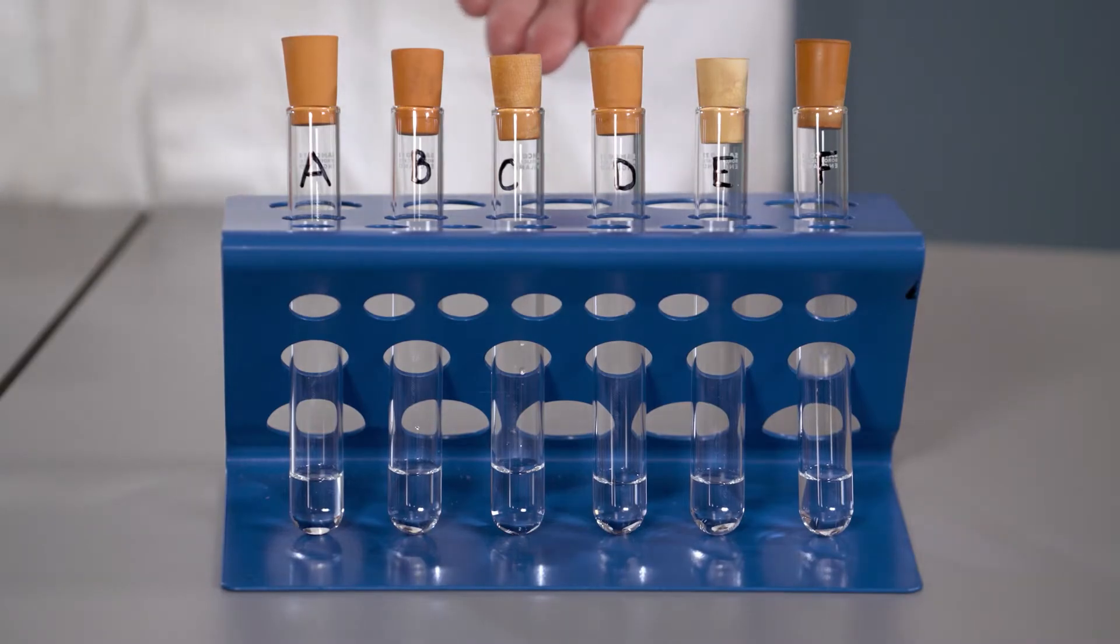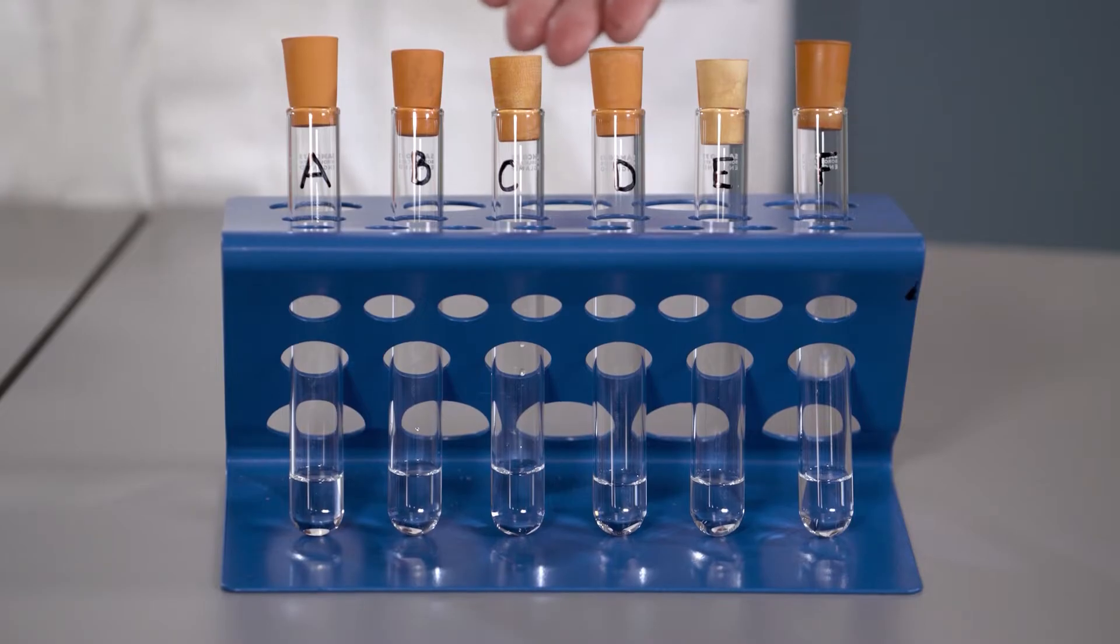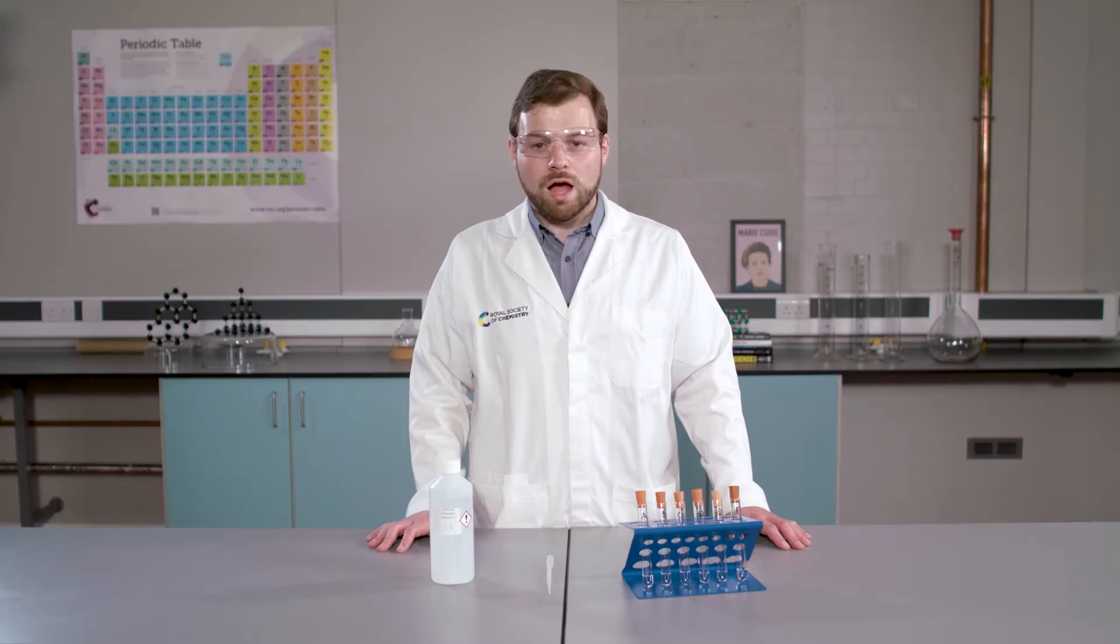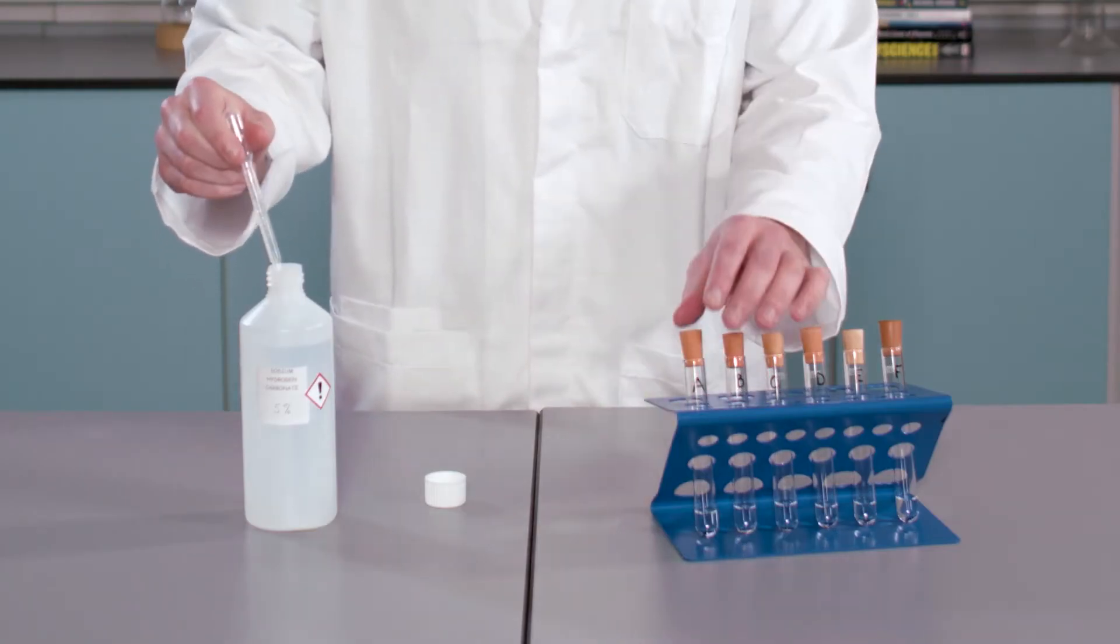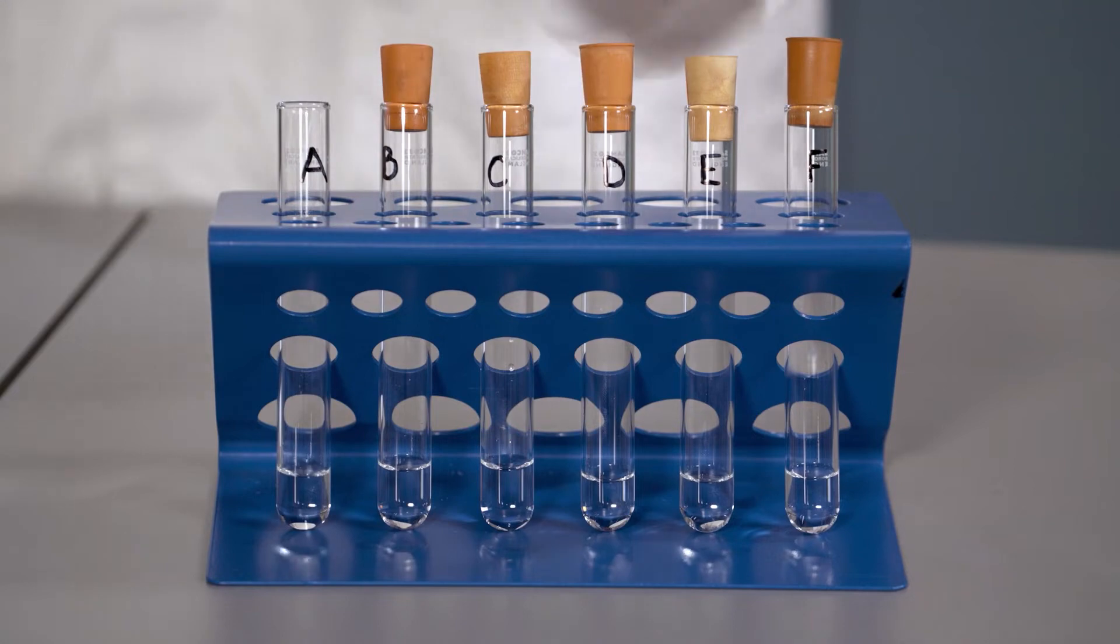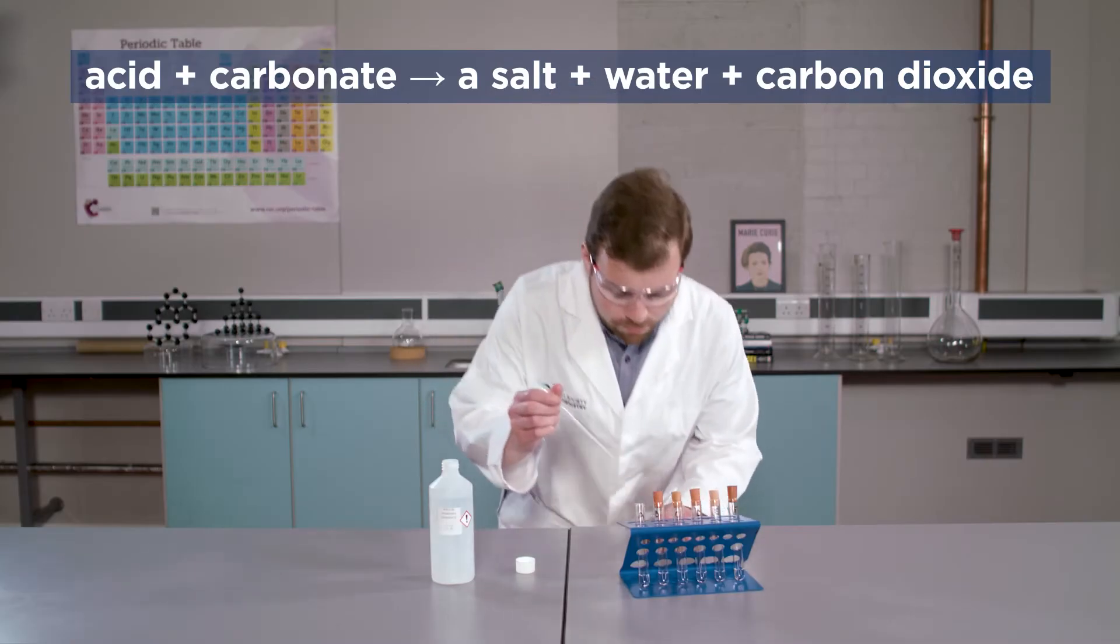Here, I have labelled 6 test tubes A, B, C, D, E and F, and added 2cm cubed of each sample into them. I am now going to add a few drops of sodium hydrogen carbonate solution to each test tube. Think about what we would expect to see for a positive result. Make sure you record your observations in a table.